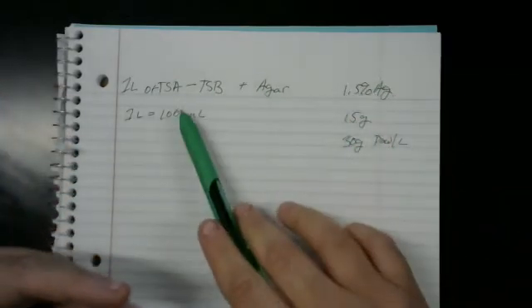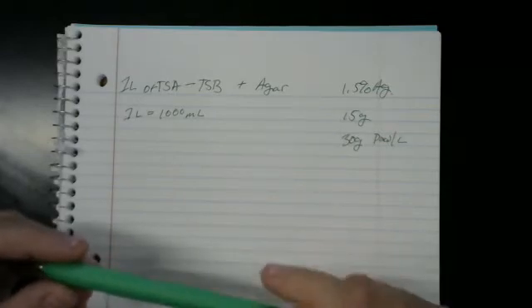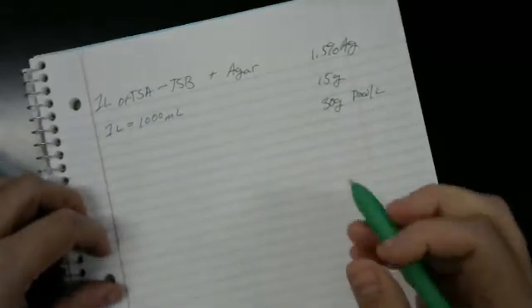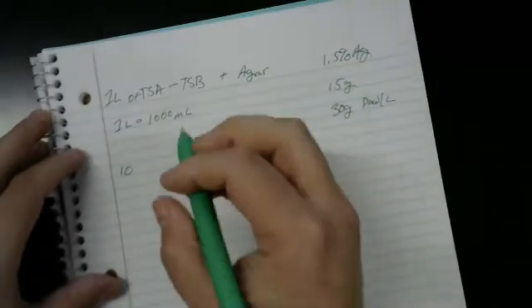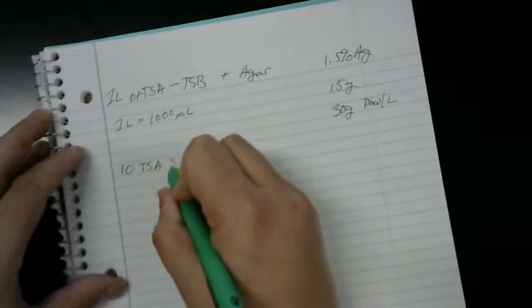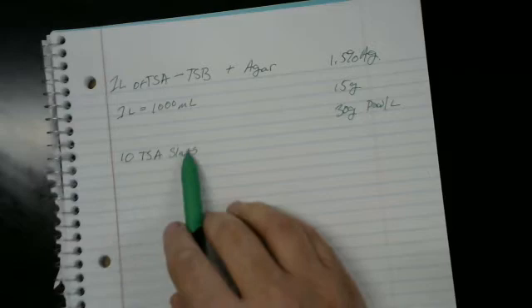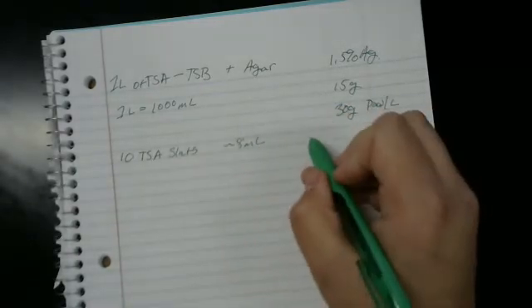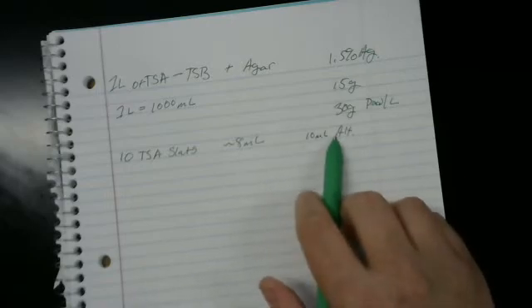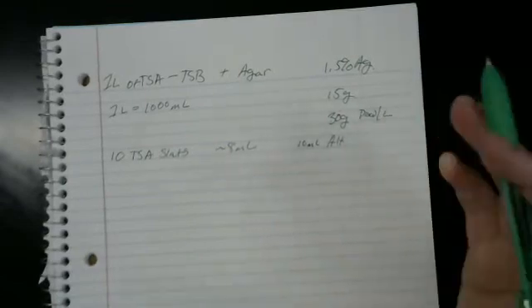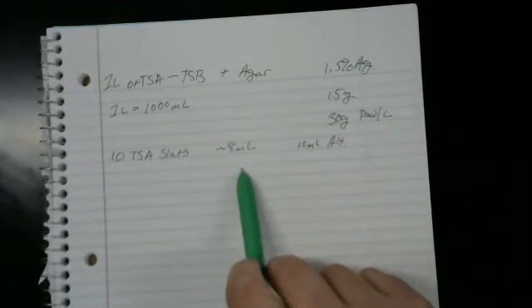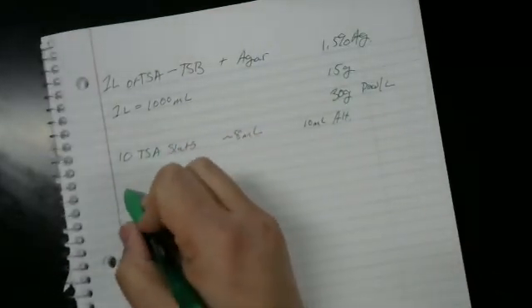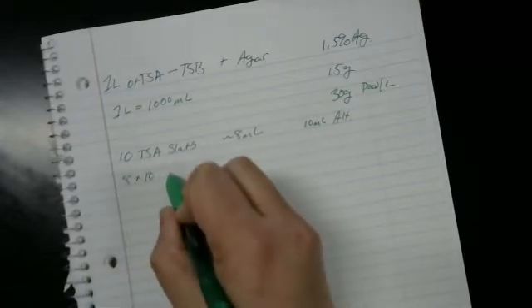This is if we're doing batch culture. Batch culture is what we use here in the lab because we burn through certain media, especially TSA. But what if you weren't making batch culture? What if you wanted to conserve as much media as possible? Let's say that you wanted to have 10 tubes, 10 slants of TSA. Well, a slant has around 8 mils.